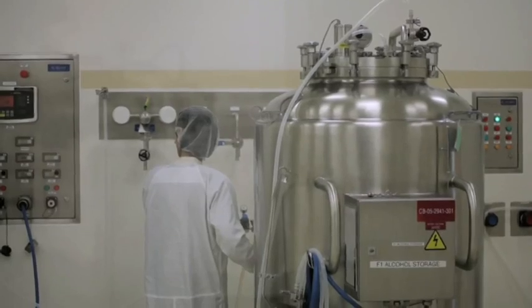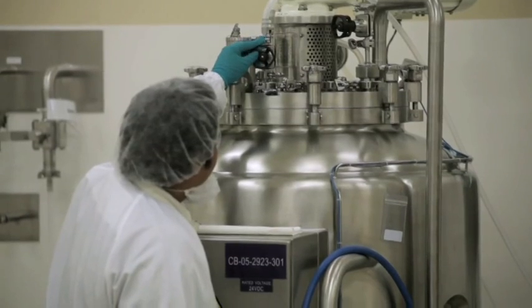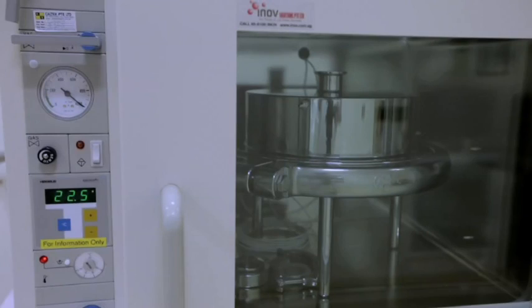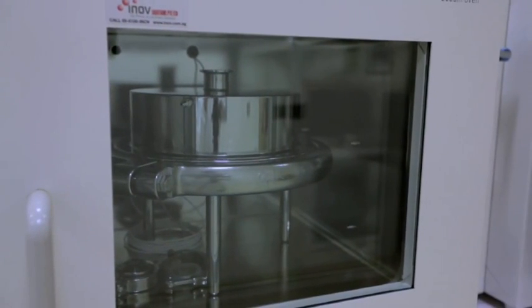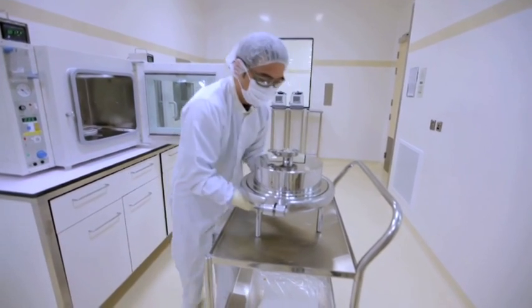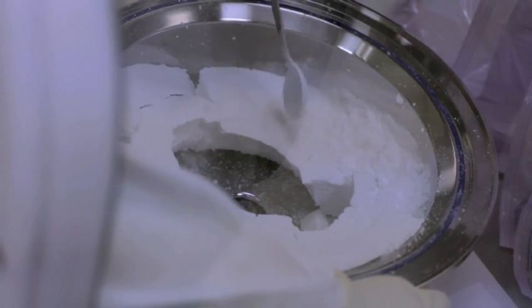At the end of the upstream process, precipitation is carried out to recover the polysaccharides in powder form. The powder polysaccharides are then dried under vacuum conditions to reduce moisture before it is dispensed into the appropriate weight.